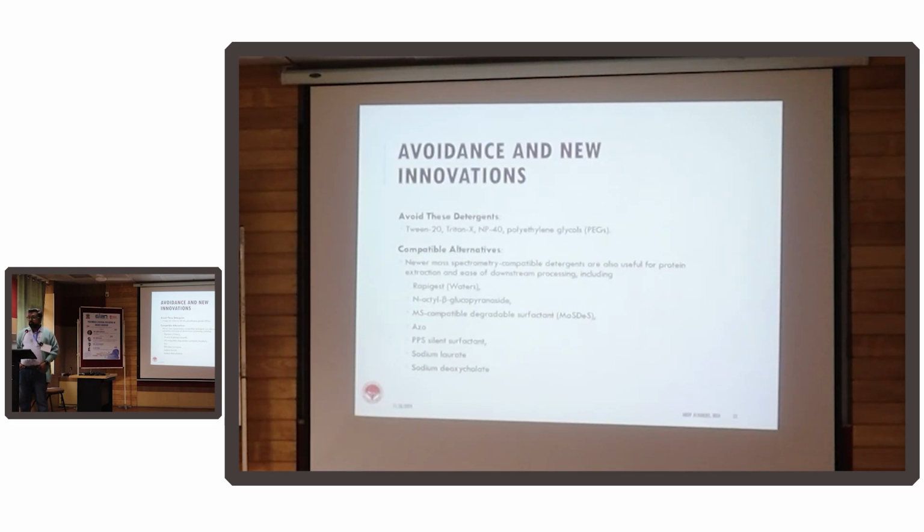But always avoid Tween 20, Triton X, NP40 and polyethylene glycols of any kind, because not only will removal be a big challenge, the worst part is even if you have a very small carryover, it will destroy the mass spec.